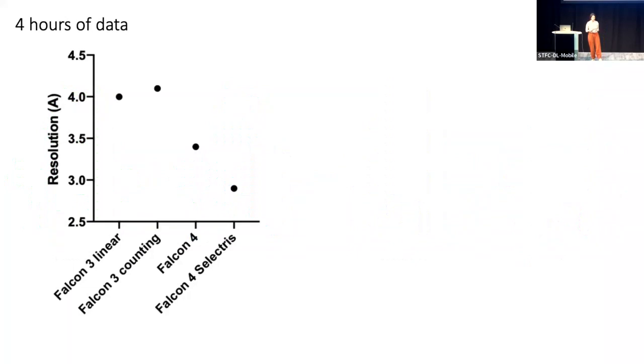So what I wanted to do now was just show you the resolutions that pop out of that. Again, this is probably no surprise to anybody, but the data that we got from the Falcon 4, the nominal resolution from that reconstruction was better than the Falcon 3 in either mode. And I must admit, I was slightly surprised, although this has also been reflected in many different projects that we've had through the microscopes in Leeds.